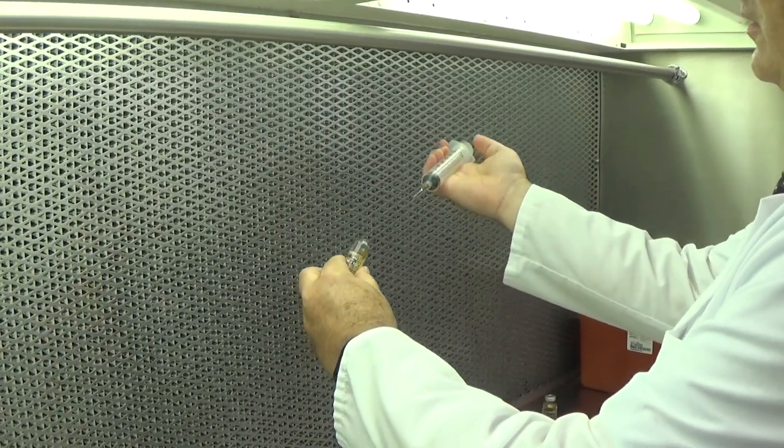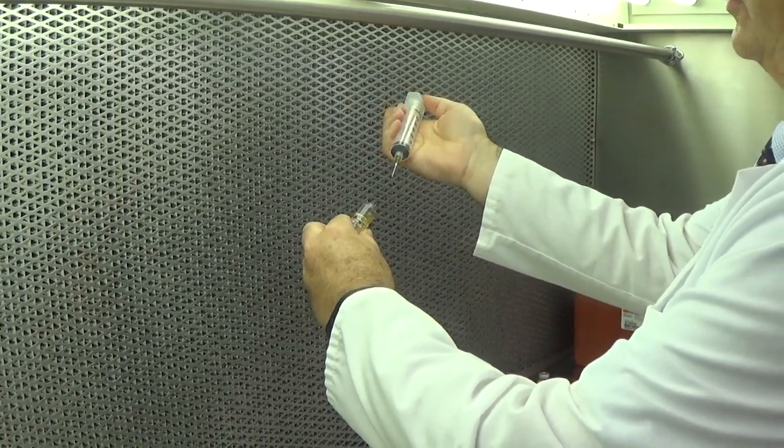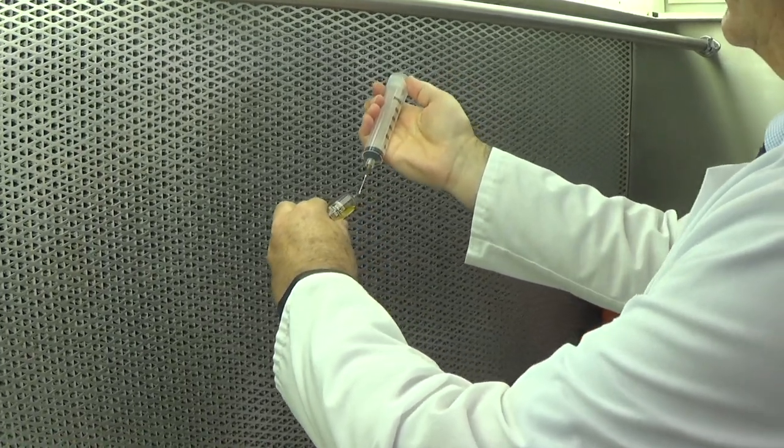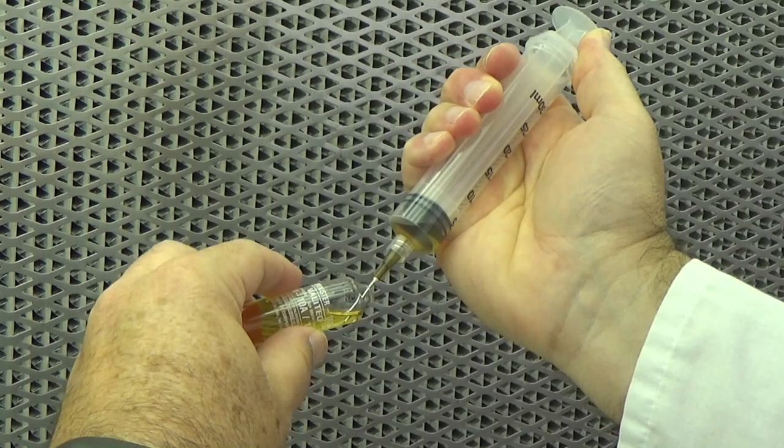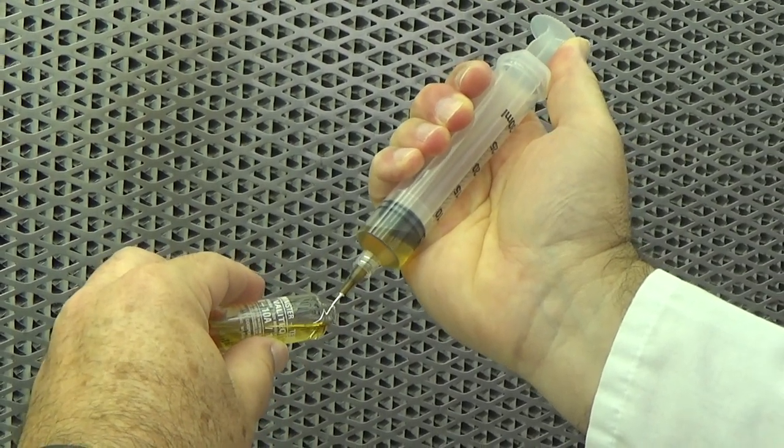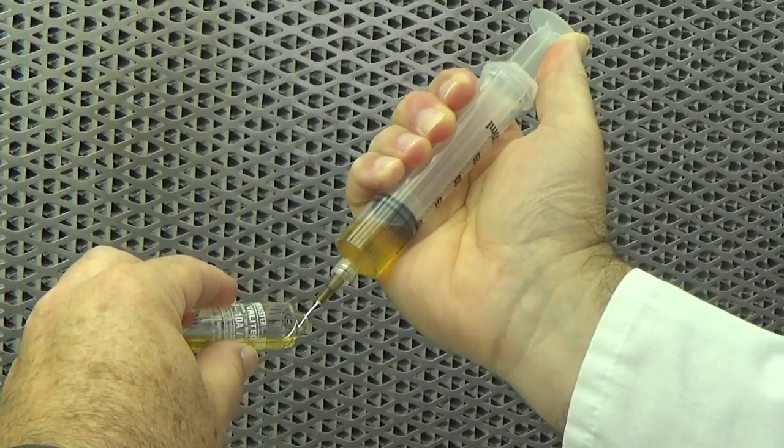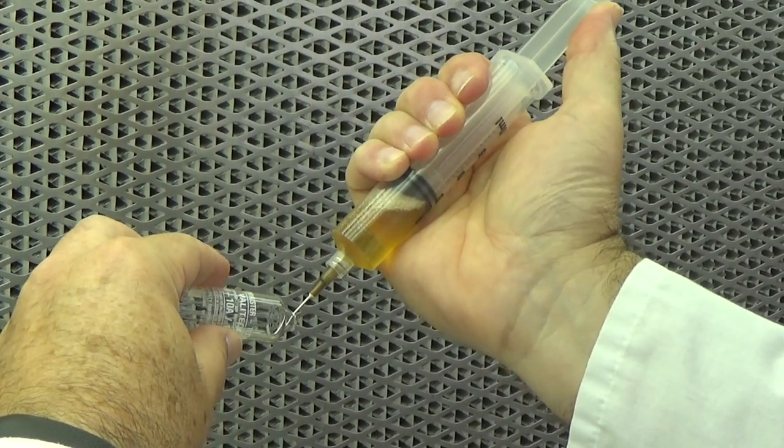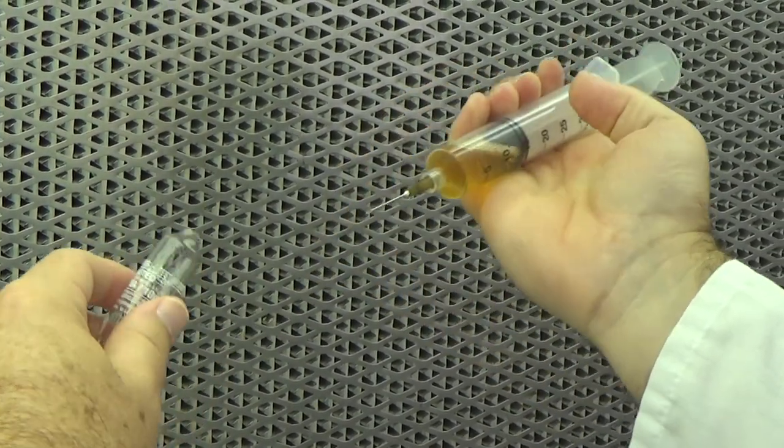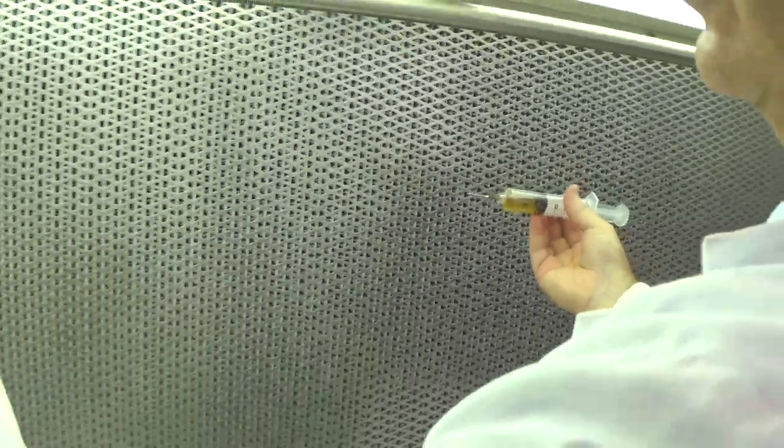To withdraw the contents, I'm going to grip the needle and syringe in such a way to introduce the needle into the liquid and start withdrawing the contents. Once all contents are withdrawn, this is disposed of in a sharps container.